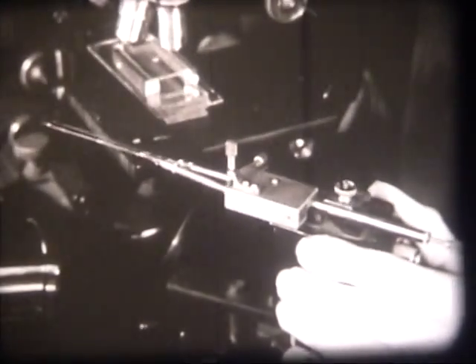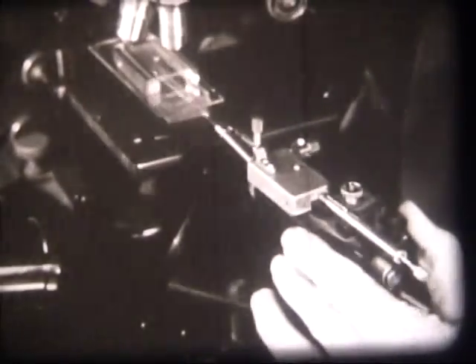Here we are putting the needle into one of the open ends, and you will see the protoplasm on the underside of the roof of the moist chamber. We move the protoplasm aside for a moment in order to find the needle. And here it is. Now we are ready to dissect and to prove how tough and elastic protoplasm is.